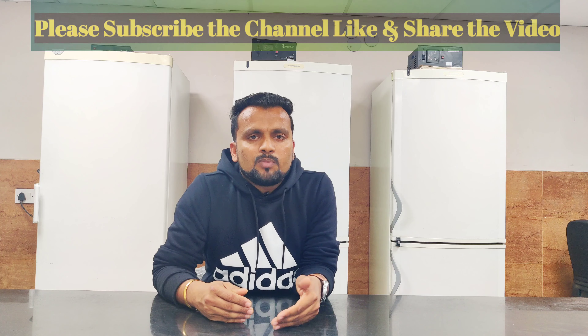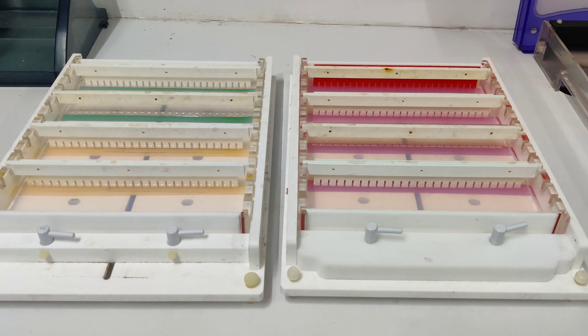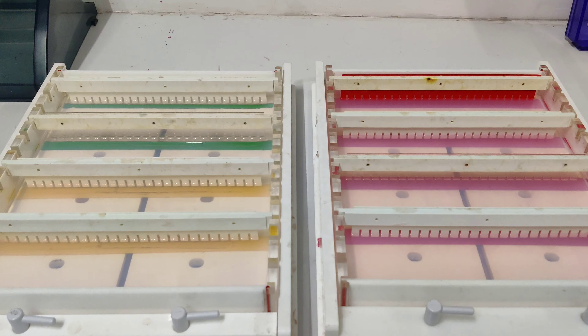After about two to three hours you can see both PCR products very easily separated. You take a picture, and by using this technique you can run two PCR plates in a single gel. This way you can save your time and your consumables also.